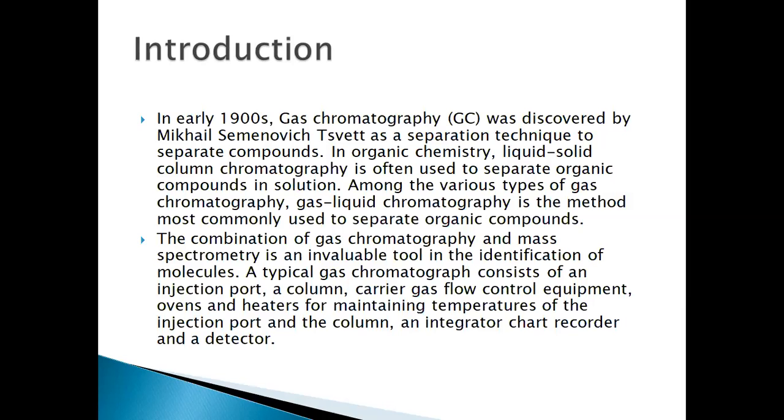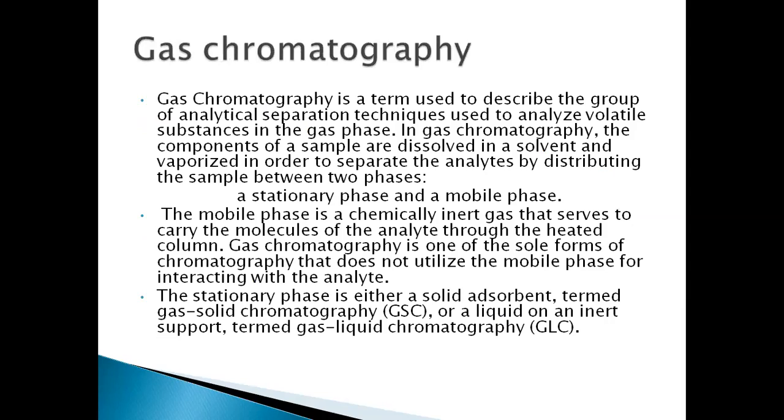We study about the stationary phase. Stationary phase is a microscopic layer of liquid or polymer on an inert solid support inside a piece of glass or metal tubing, which we call the column.